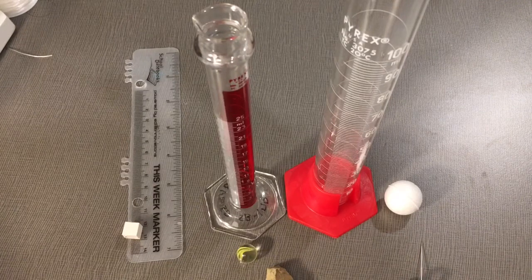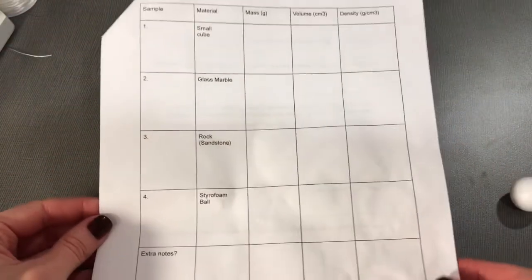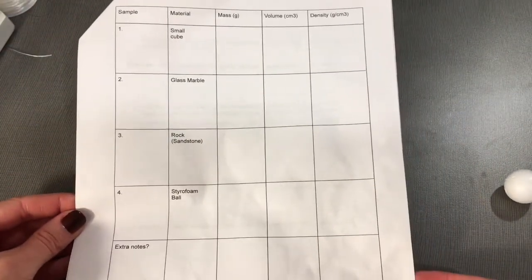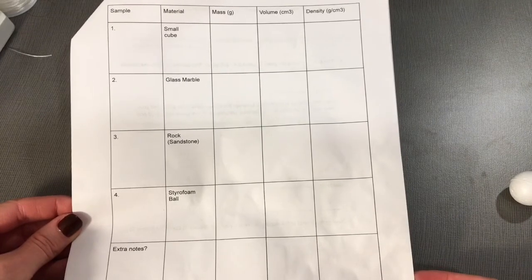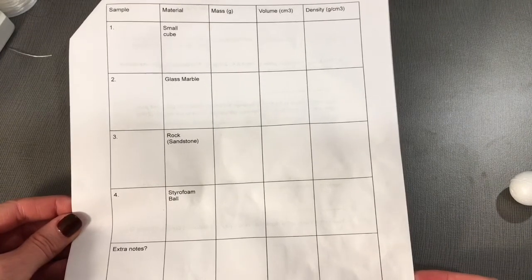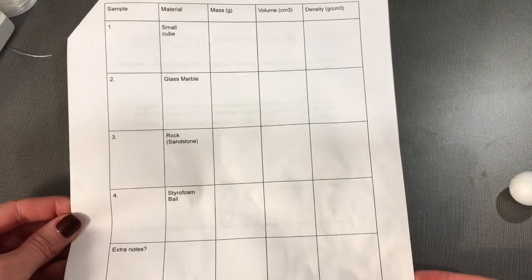Point 3 on page 2 says then to calculate the density in grams per centimeter cubed. After you complete sections 1 and 2, you can calculate the density of your cube, glass marble, your sandstone rock, and styrofoam ball.